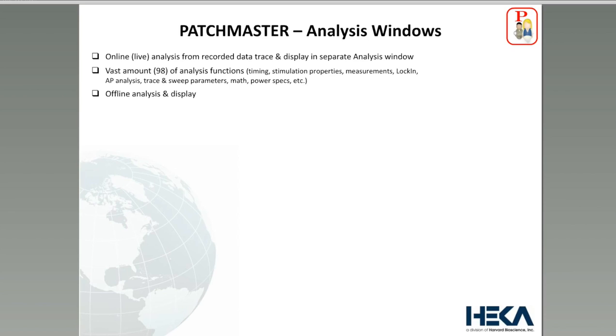The online analysis is basically that you can record a data trace, and while you are recording it, an analysis is being done already. This also works, of course, offline. The second point I would like to make is that you have a vast amount of analysis functions available. And we will not talk about them all, but I will show you in the live demonstration how you can actually use the online analysis and also show you where you can select all those functions.